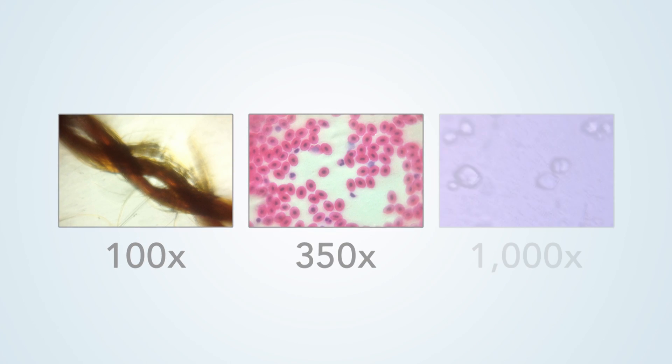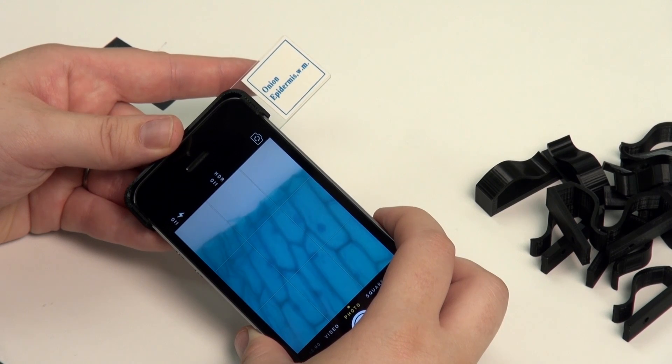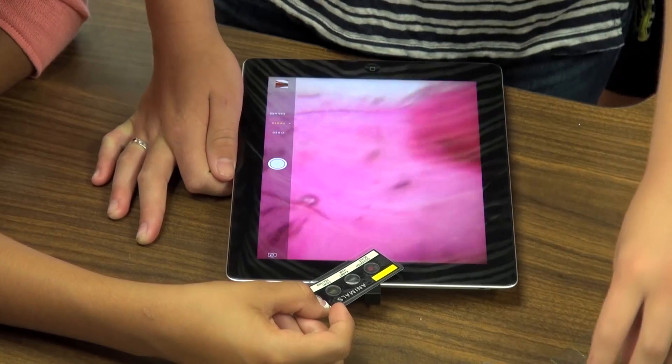So we have three different magnifications now: 100X, 350X, and 1000X. We've also made different versions that will fit multiple phones. We've found that the iPhone 5 provides a more optimal picture, but it is capable of functioning on multiple smartphones and tablets.